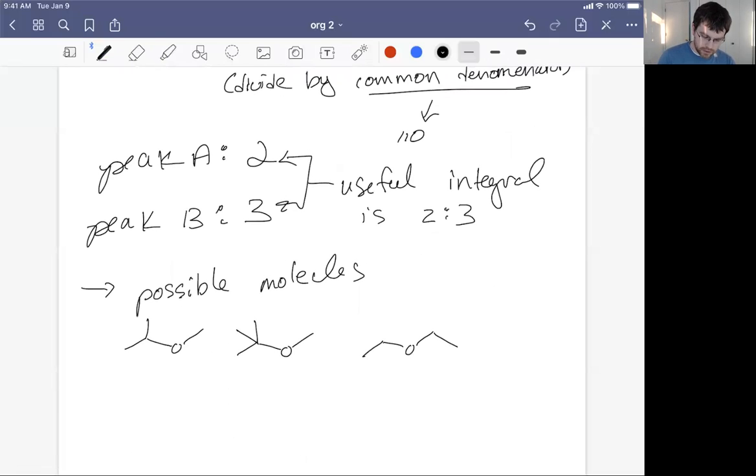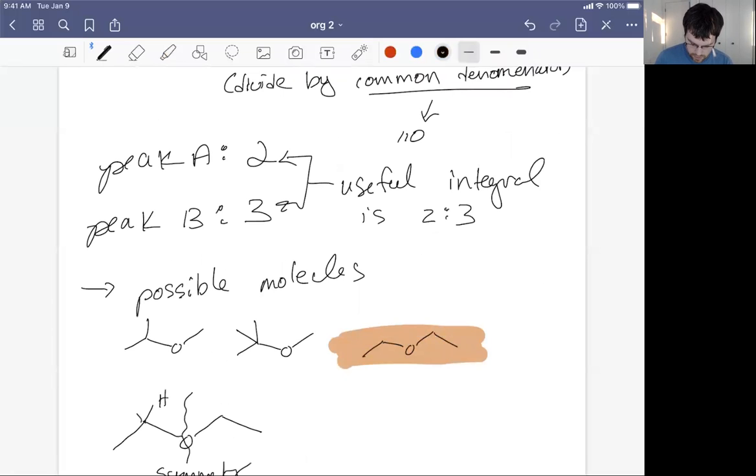Well, the answer, without lingering too much on what is already a long lecture, is this. Because this molecule, which we said has a bilateral plane of symmetry, is going to have two types of H's.